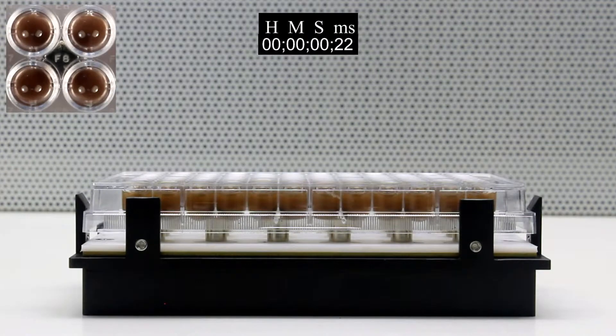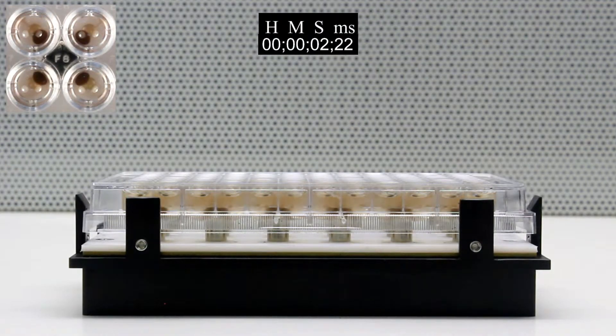The VP771L series magnetic separation device can be used for 96 well round bottom microplates. Although this video demonstrates with a standard height plate, it will also work with deep well plates. The magnet design will pull the beads to a single pellet on one side of the well, leaving the center of the well clear for clean aspiration.